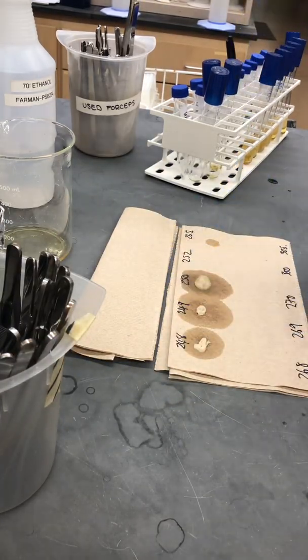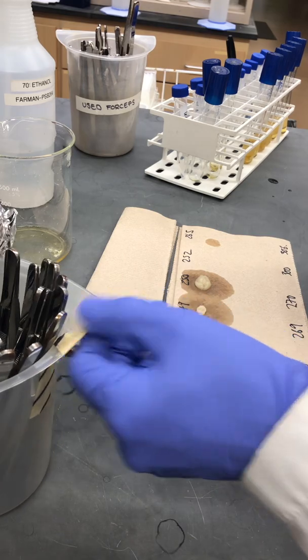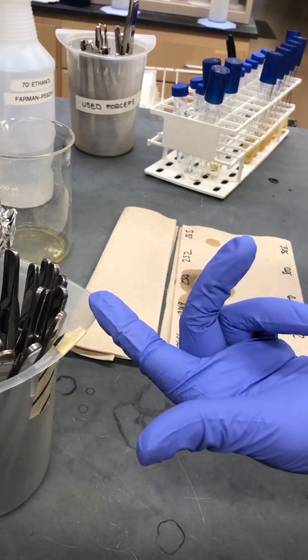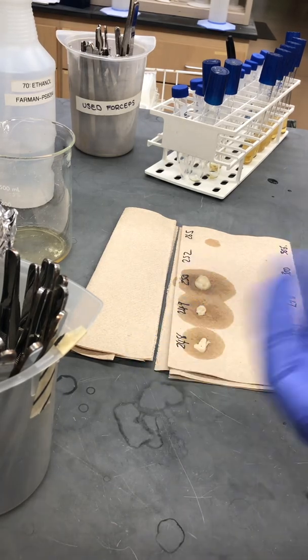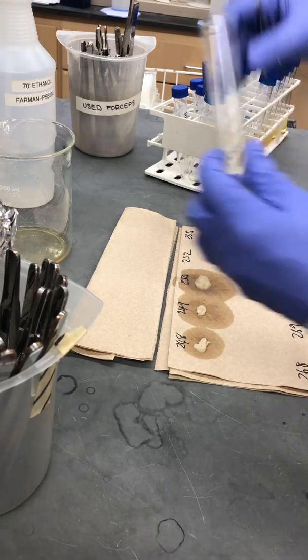We keep sterilized forceps on hand so that we don't have to keep flaming forceps in between each use — it just allows us to process the samples a lot more quickly.